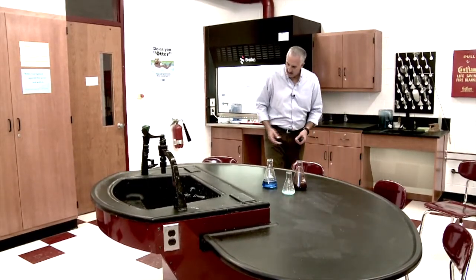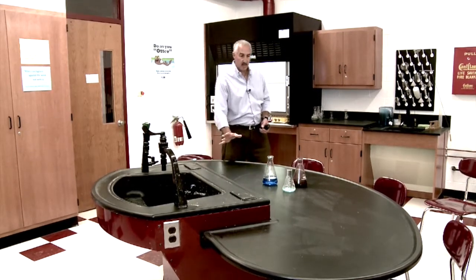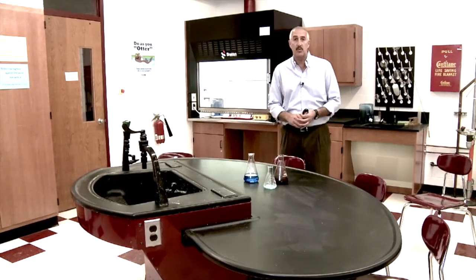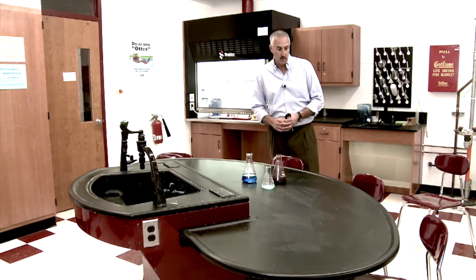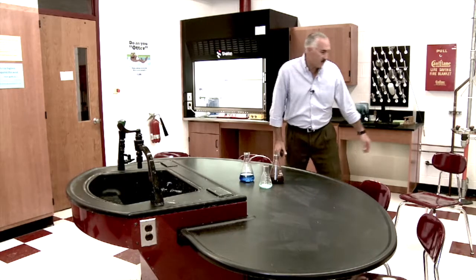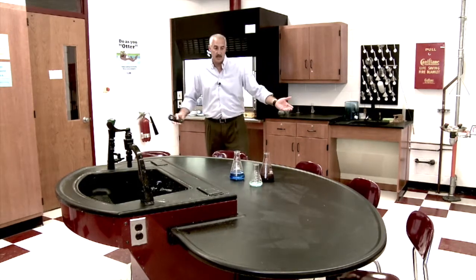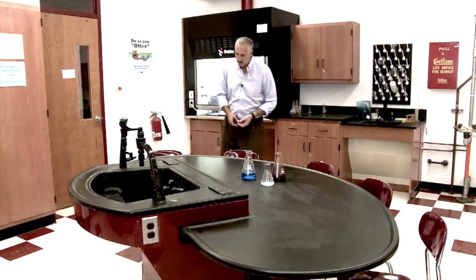The nice thing about this size table is we don't always have the luxury of having 24 students in a room with six of these units in an ideal situation. Easily enough, we can fit five, and even more students — up to six students — around the table. So if we have overflow in our classrooms, this accommodates that.